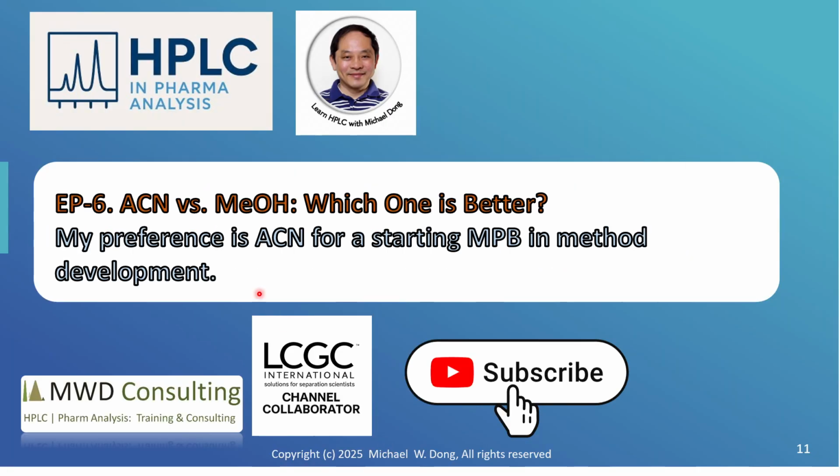On this note, I'd like to thank you for listening to episode 6, acetonitrile versus methanol, which one is better, and I have clearly defined my preference as acetonitrile as a starting mobile phase B in method development.